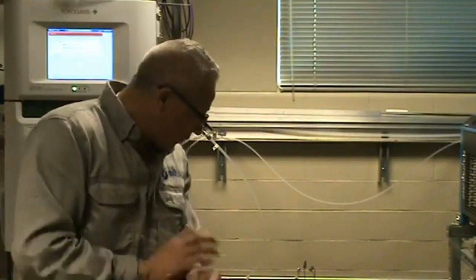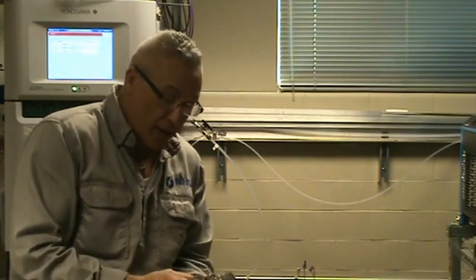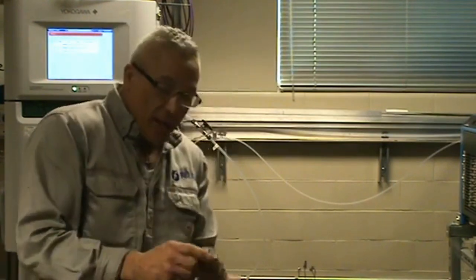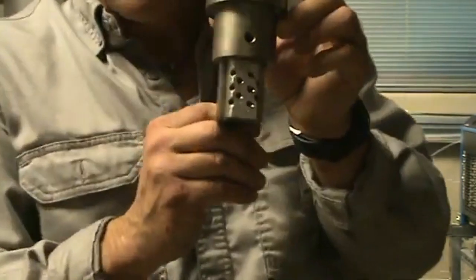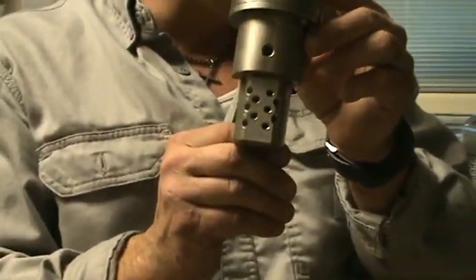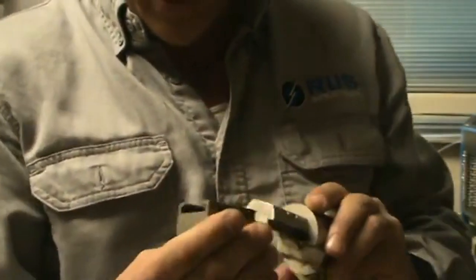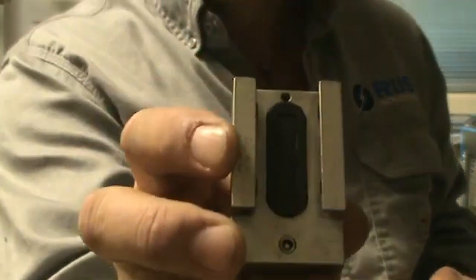I was talking about valves and them doing the movement of everybody through our columns and back flushing, if we wanted to do a heart cut, however we want to do it. This is an ABB slider valve. It works basically the same way as all these valves; they each have their own little technique. You see these little cuts that it has?